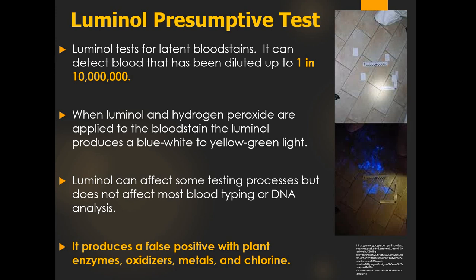It produces a false positive with some plant enzymes and oxidizers, metals and chlorine. So there are some problem things that you need to be careful of, and you need to know your limits there.